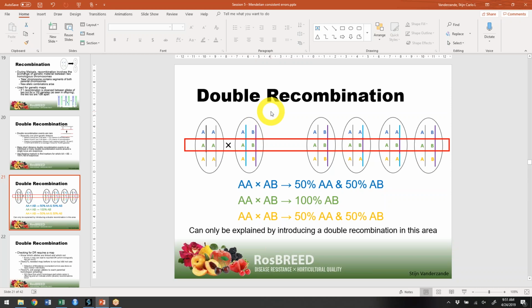And that's just important to understand some of the FlexQTL output files that are being created, which are called GPO output files. They stand for grandparental origin. Those are files that FlexQTL creates to keep track of where chromosomes or segments are coming from. We won't really use them a lot right now, but when you're using FlexQTL a lot, you'll see those files and you may want to look at them. Those GPOs are used to figure out which alleles are on the same chromosome physically.